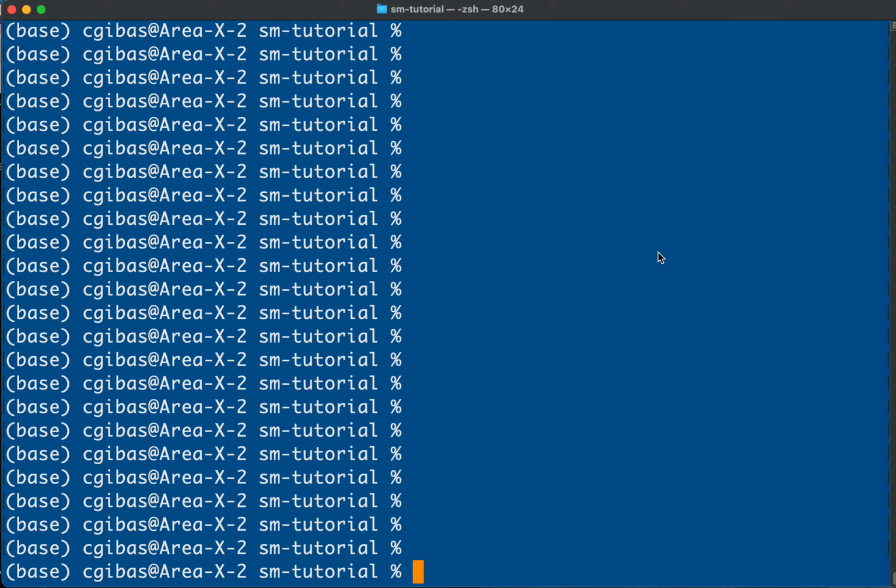So what we want to do right now is filter our abundance table down so that we are only looking, for the purposes of this exercise, at genus level classifications. And how we do that is what we showed in the last videos. We are going to use grep. So grep -E, and we're going to look for a pattern that includes either genus or something that we find on the column header line of the file that we created.